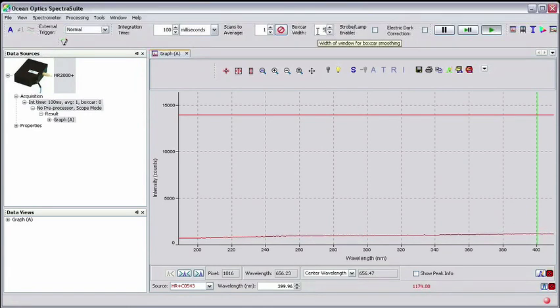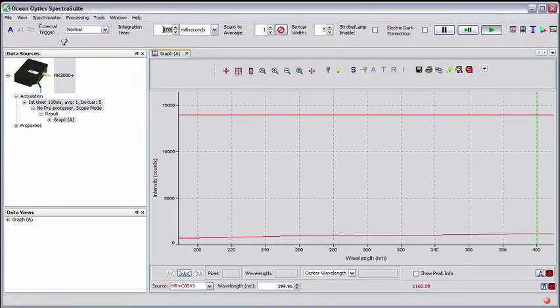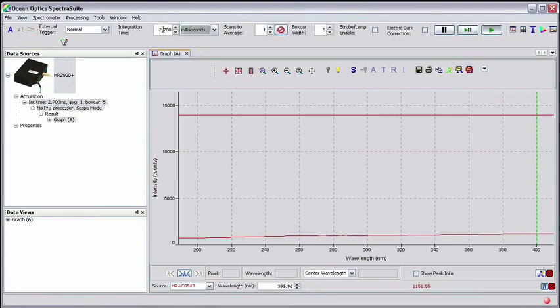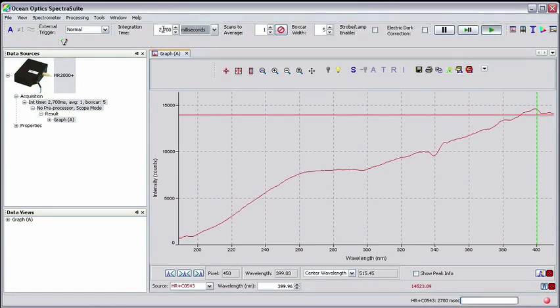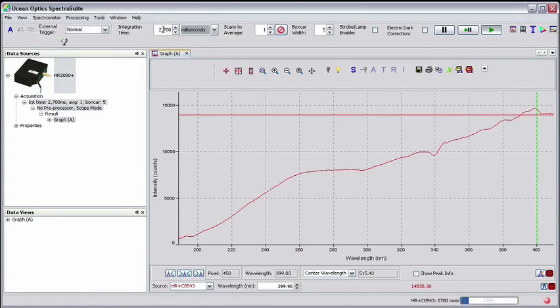Next, we'll manually adjust the integration time until part of the displayed UV is at or just slightly above the peak baseline on the display. Make a note of this integration time since you'll need to input this value later on. For this case, our integration time was 2.7 seconds. Close the spectrum graph by clicking X.